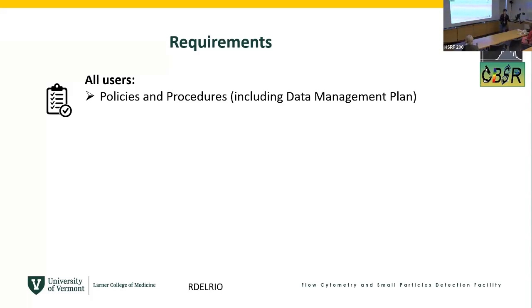Regardless of what you want to do at the facility, all new users will receive the policies and procedures, including the data management plan. All facilities have such.